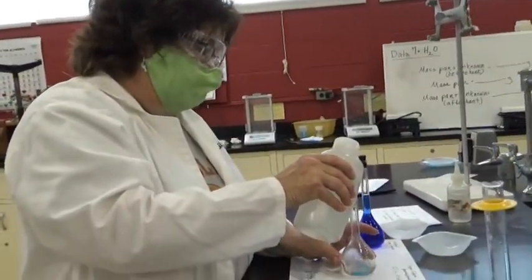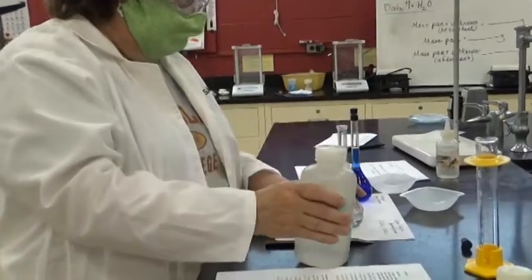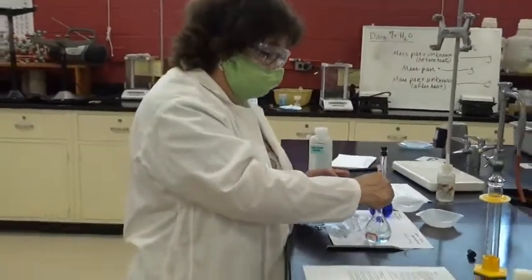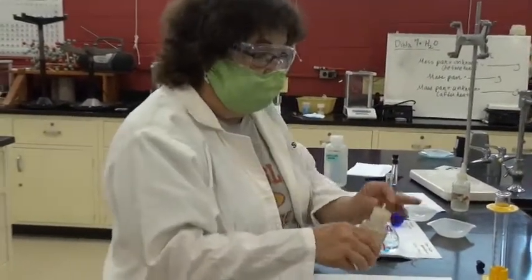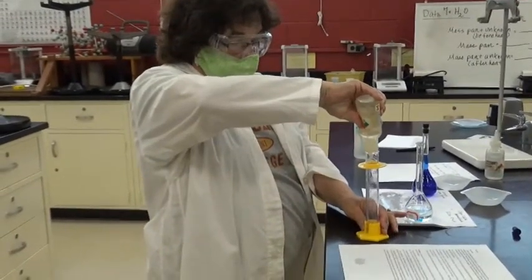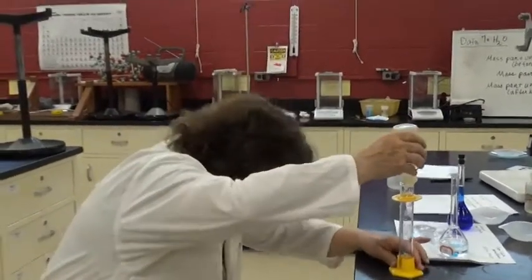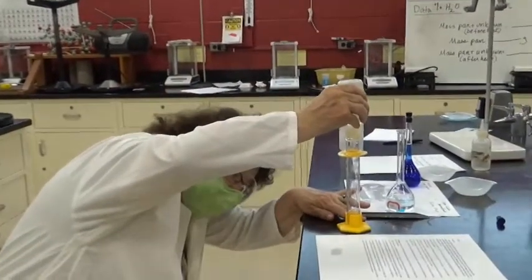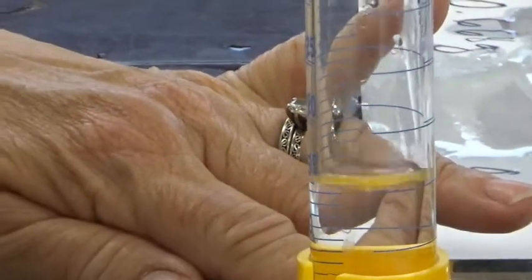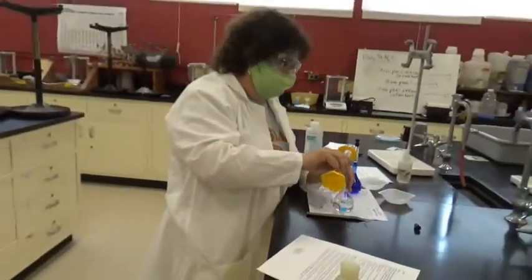All right, it says to add a little water first. Okay, let's roll it down. 15 milliliters of ammonia, again, the same preparation. Again, you control what it says. And the more you do this, the better you get at it, so not to worry.